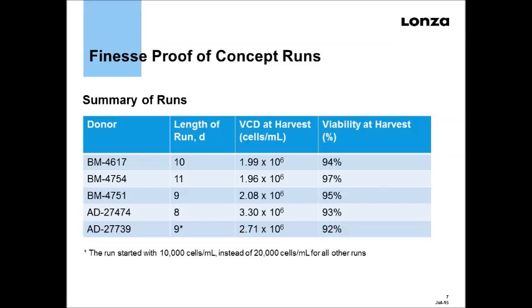More importantly, as we scale up, we can go to a 200, maybe as high as a 500-liter bioreactor. Again, we can get up to maybe 1,000 doses per bioreactor. Remember, this is a unique technology because, except for the cancer lines, which are cell lines, these are primary cells, which means you can only double the cells so many times before they are done. So we hit a cap between 250 and 500 liters in a bioreactor before we can expand any further. So again, commercially viable is what we're looking for.